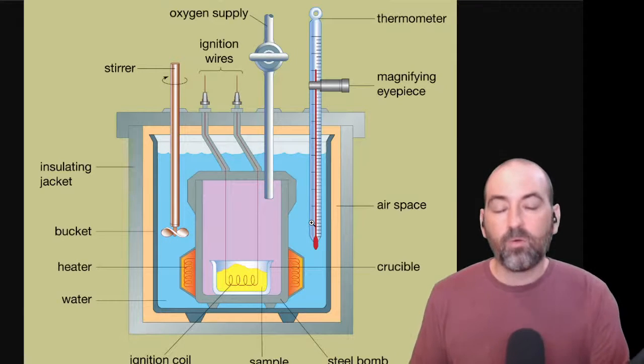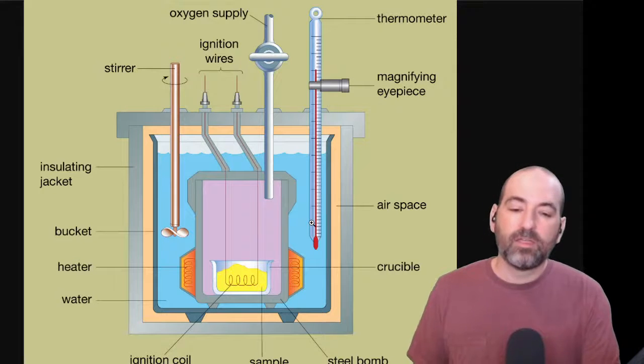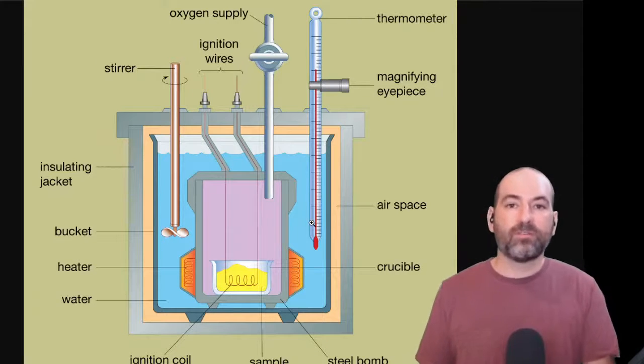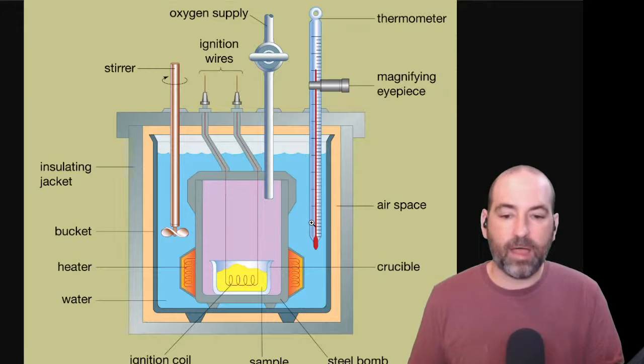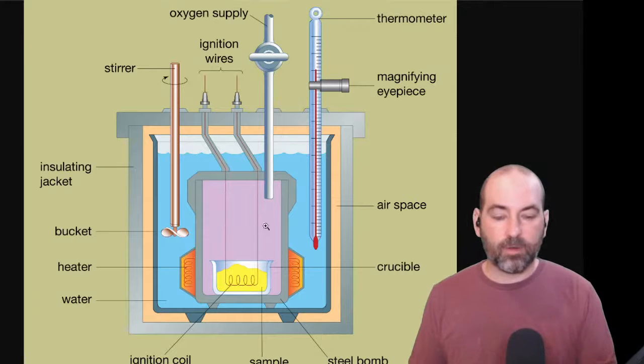So then we can use the equation, although we're going to adapt it a little bit to make it a little more precise, to figure out how many calories of energy were in that particular sample of biodiesel. A couple other things make this work properly.